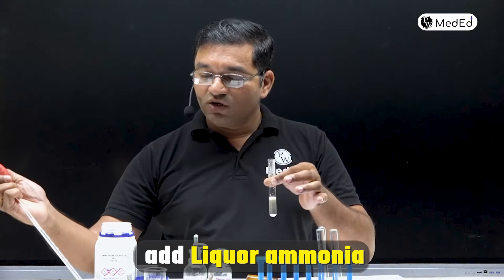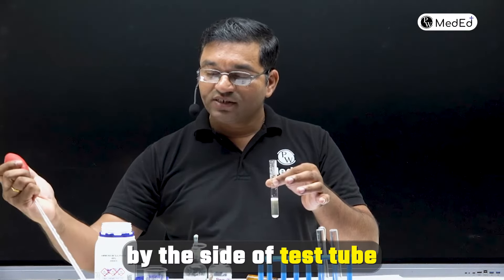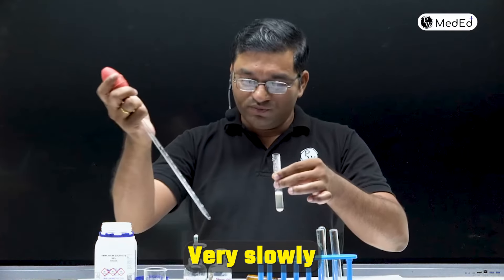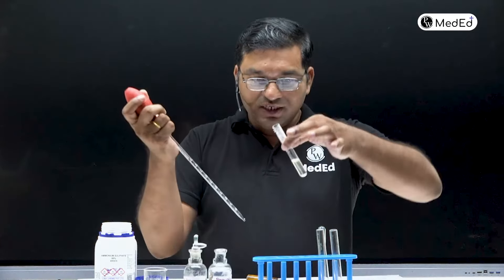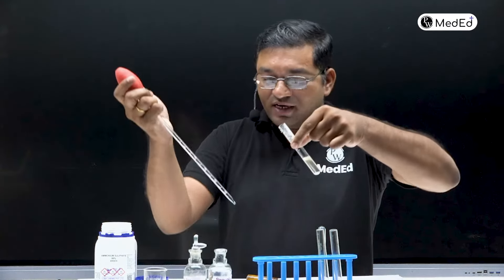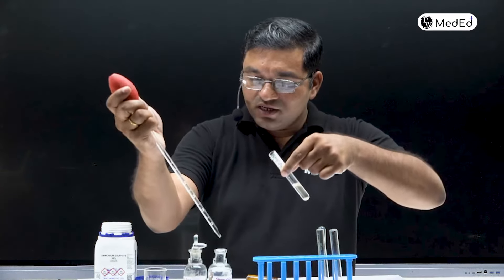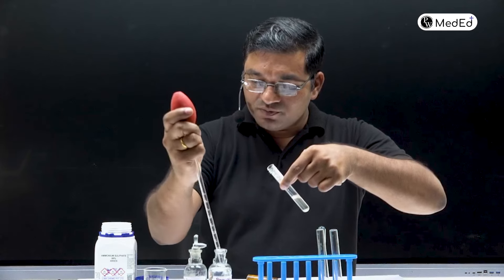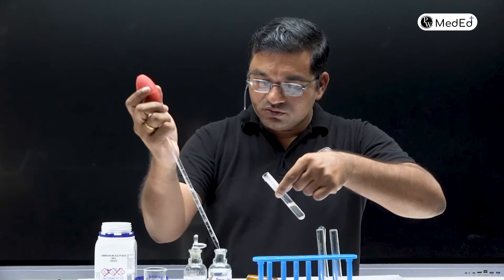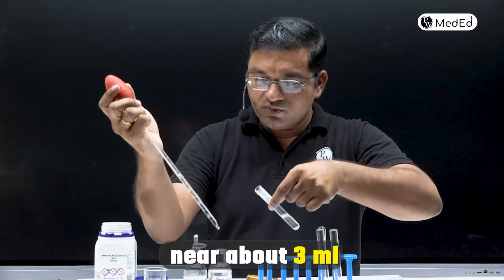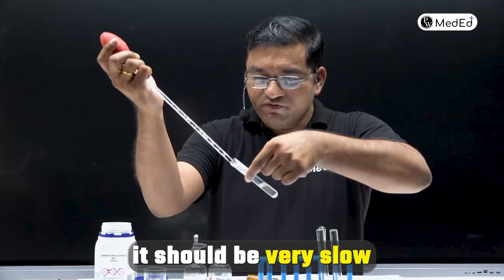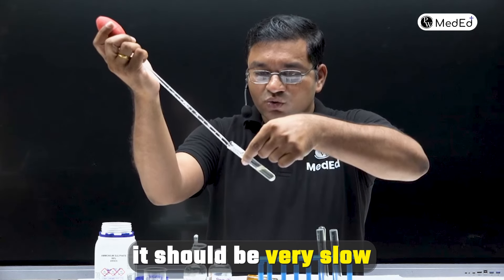One drop of sodium nitroprusside is added. Now add liquor ammonia by the side of the test tube very slowly — tilt your test tube and add liquor ammonia, about 2 to 3 ml. It should be added very slowly.